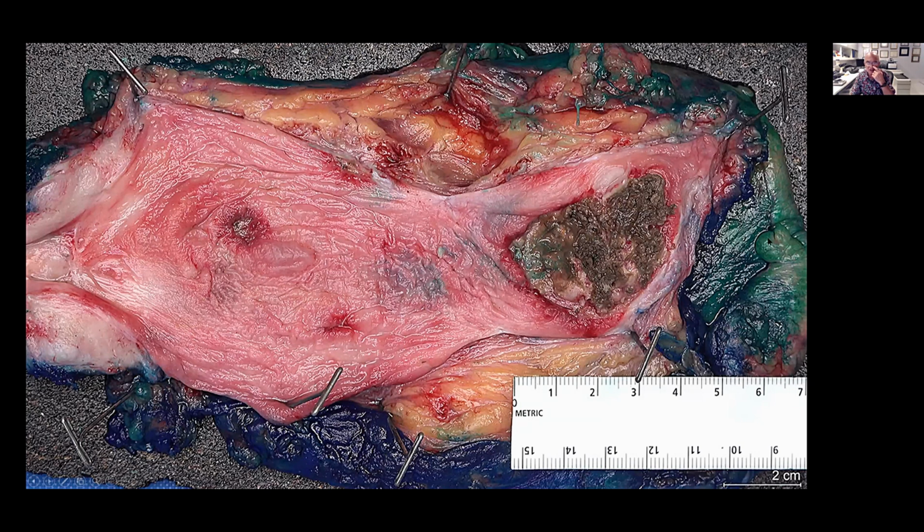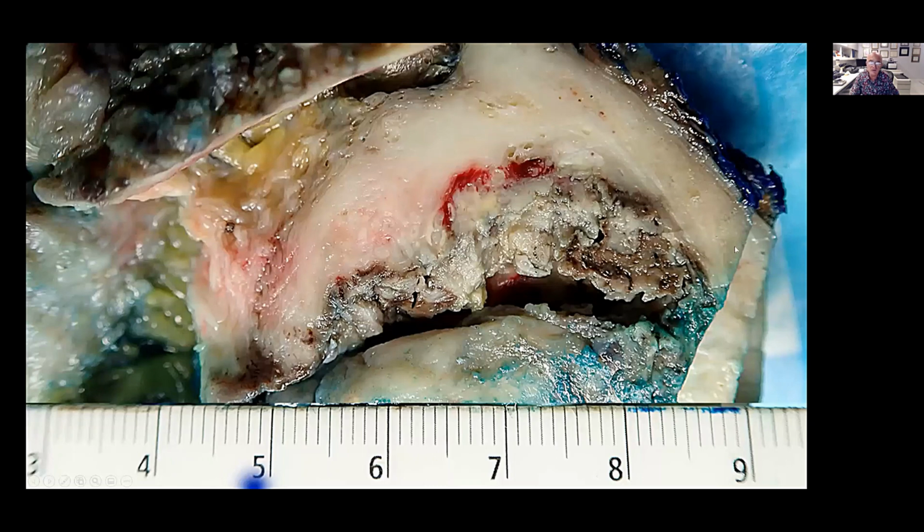internal images. It is ideal that you can take the pictures before you fix the specimen, where the conditions of the lesions are very clearly stated, as you can see in this picture. And don't forget to take pictures of the sections of the tumor, because here you can see the perivesical fat, and here the tumor on the surface of the mucosa, and here this area that looks like invasion of the tumor.